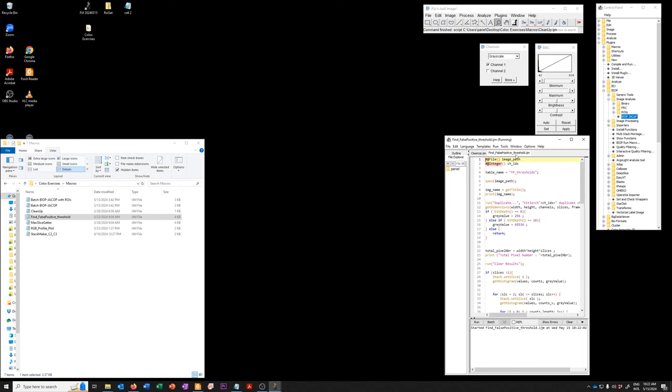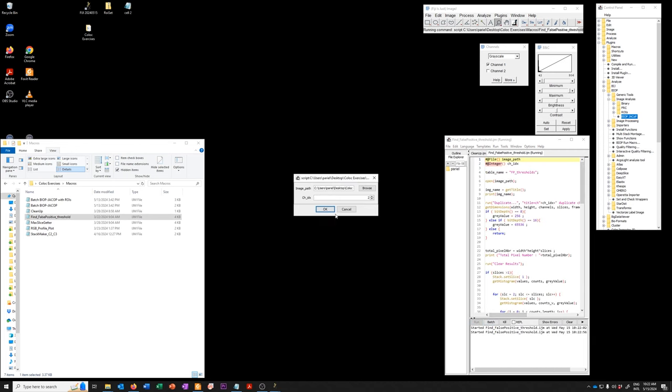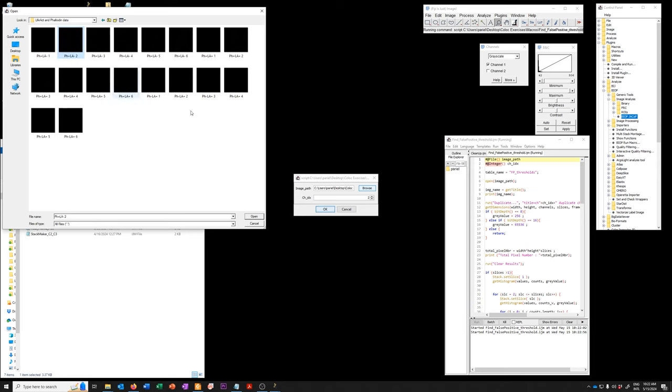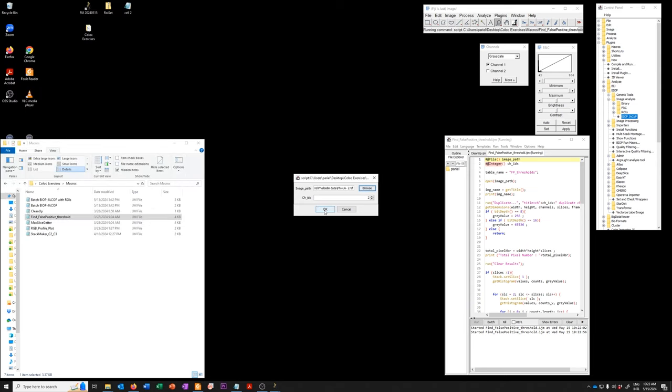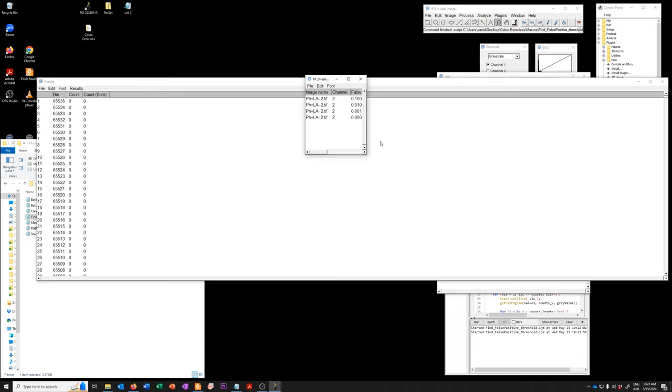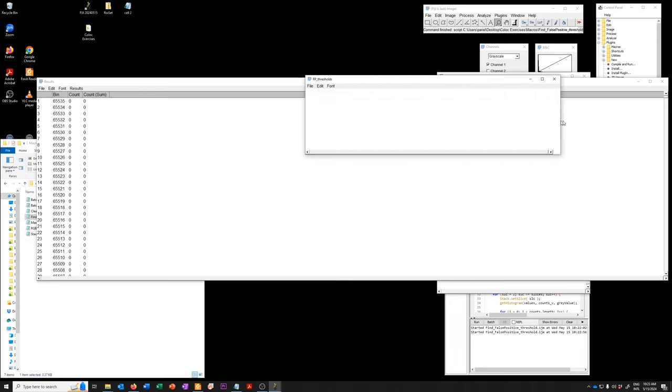And so if I now run this one again, but I run it on the second image, I just say open and okay. I now have this. I'm going to copy these over.